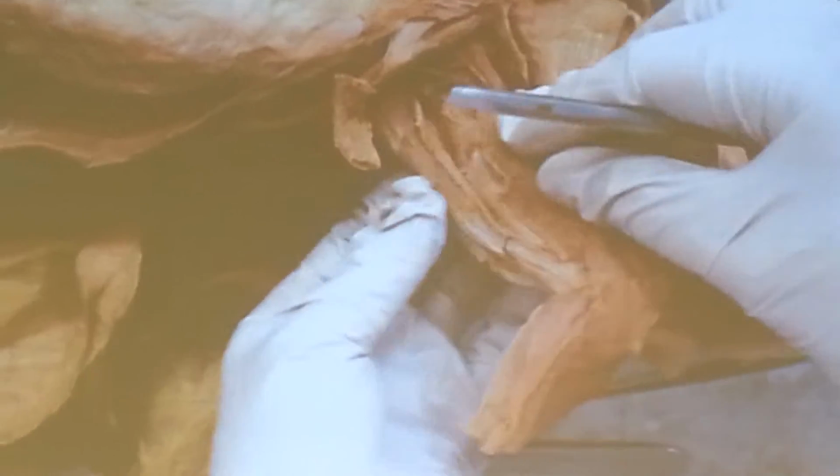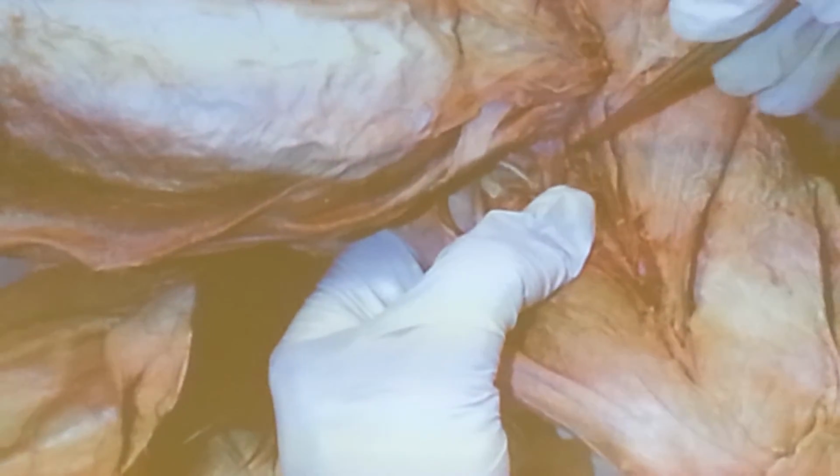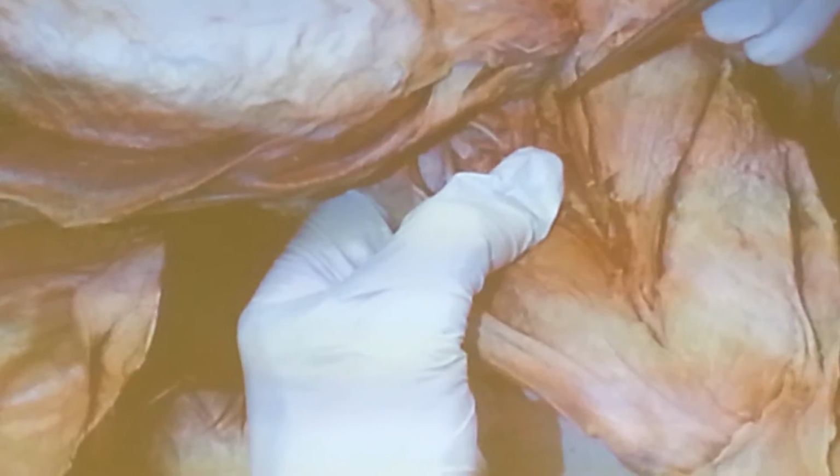Clear? Now let's go over the medial side. On the medial side of the femoral artery and vein, after putting away the gracilis, let's start from next to the femoral artery and vein. Medial to that, you have to go a little bit deep. Put this away, go a little deeper, clean it completely. You will see a small muscle here. This tiny muscle is called pectineus.